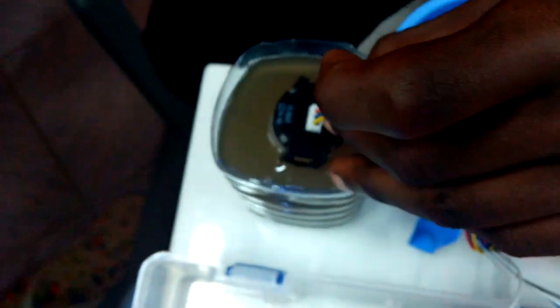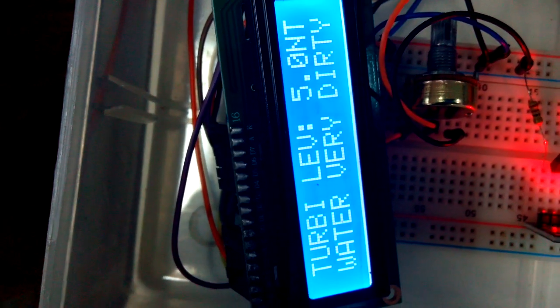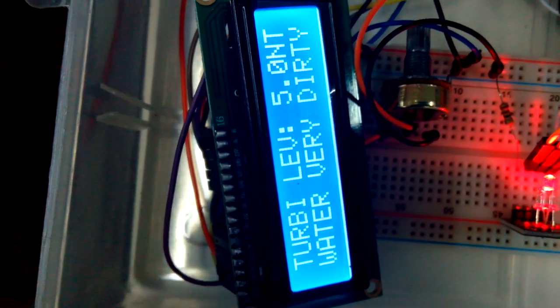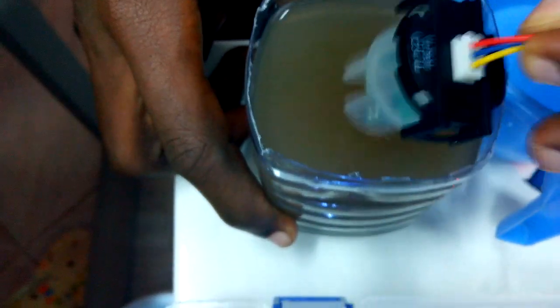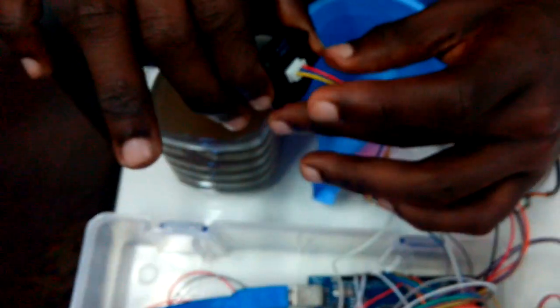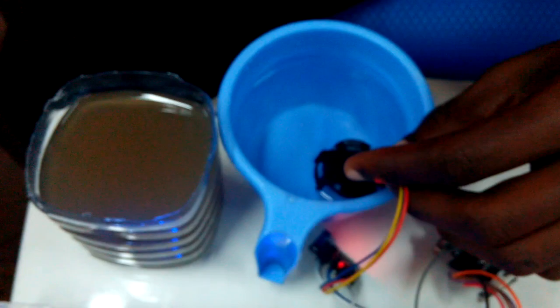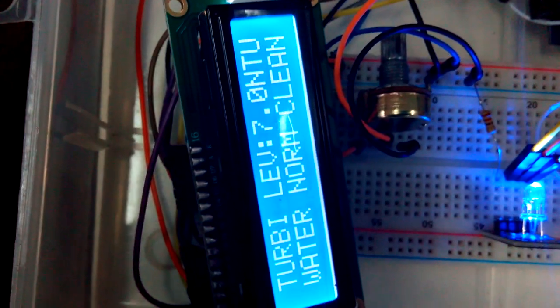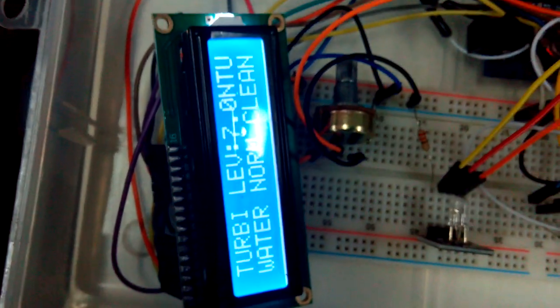We are notified that the water is dirty. Now I take it out and push it into the clean water, and it says the turbidity level is 7.09 and the water is normally clean. We do not have any problems with that.